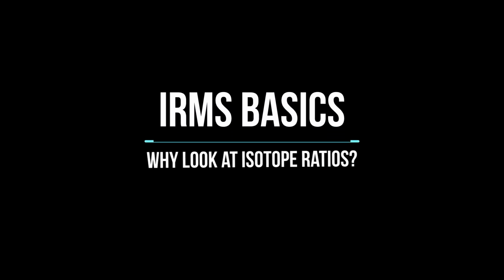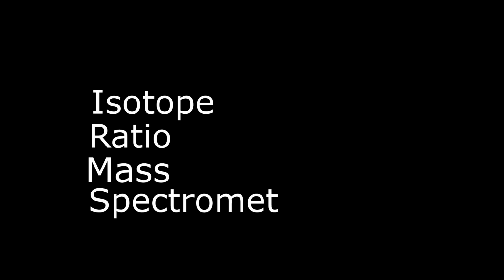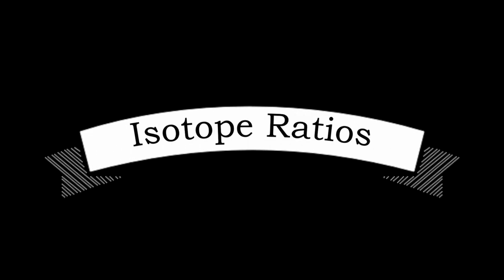Hi, and welcome to IRMS Basics, where we will discuss what IRMS means and the science behind it. This series, we will be discussing what IRMS stands for. IRMS stands for Isotope Ratio Mass Spectrometry. But what does that actually mean? Today, we will be discussing isotope ratios and why they matter.